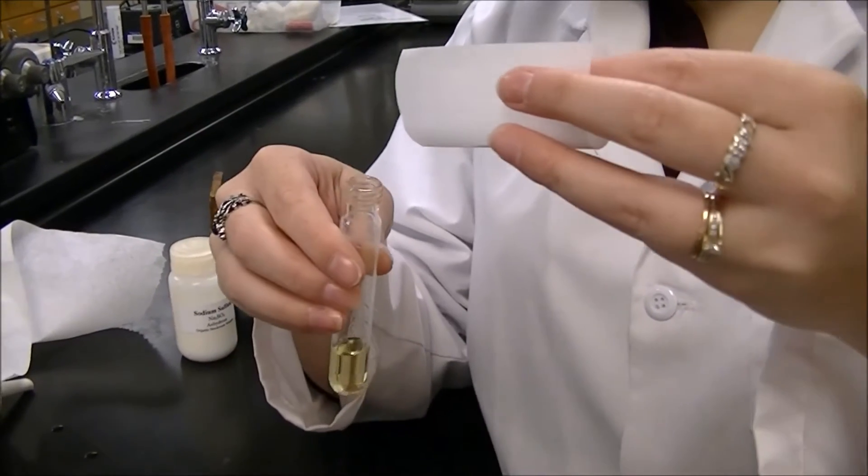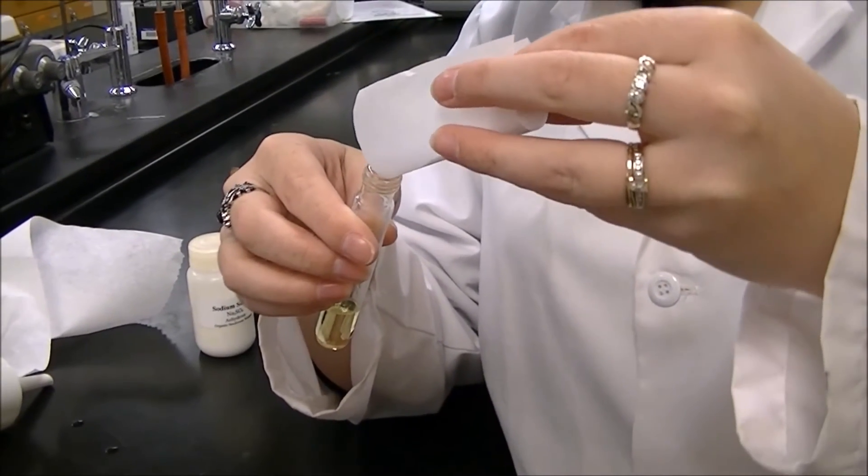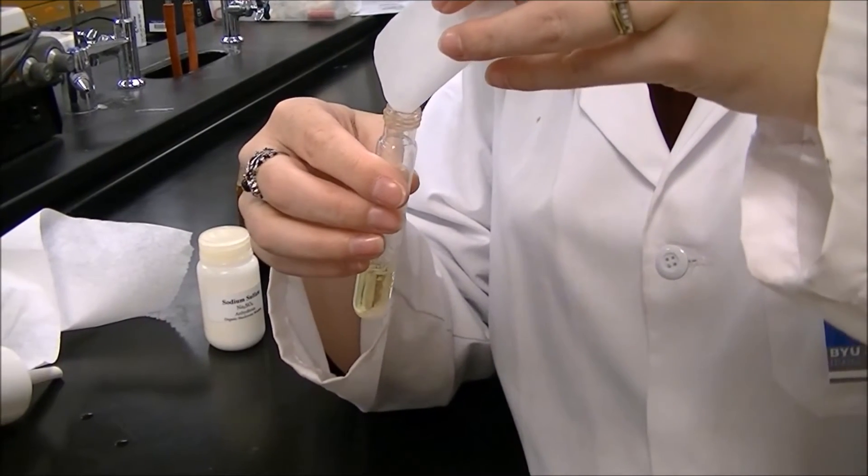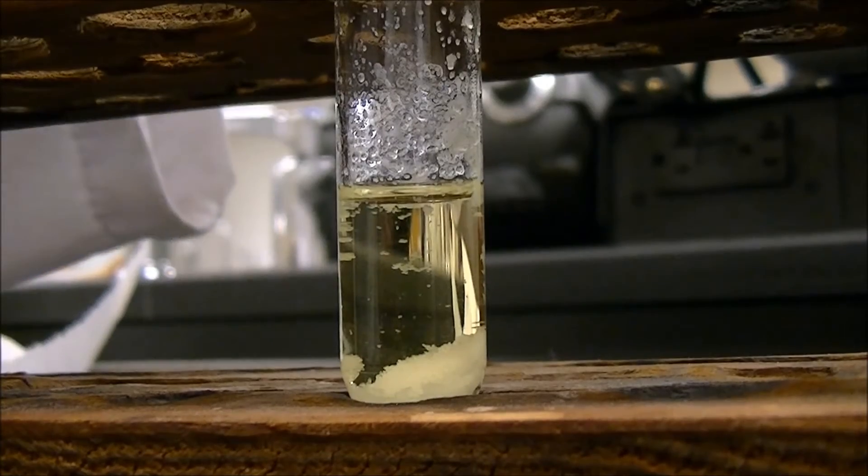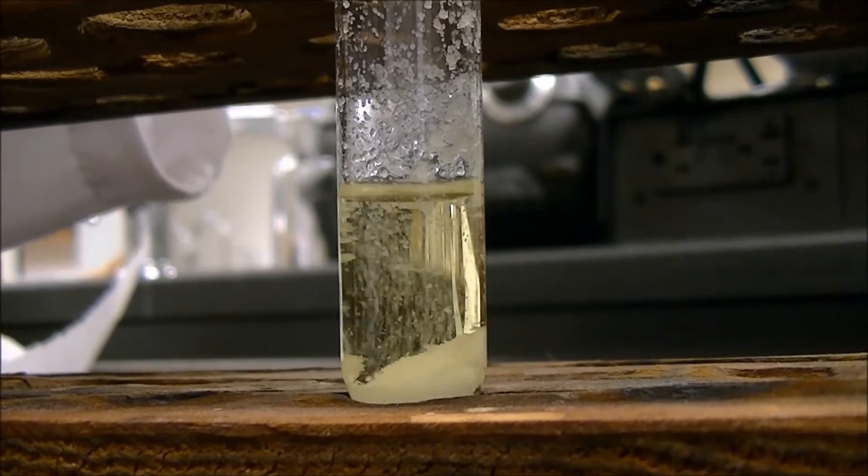Now to our remaining organic layer, we'll add anhydrous sodium sulfate. Keep adding anhydrous sodium sulfate until there is no more clumping.